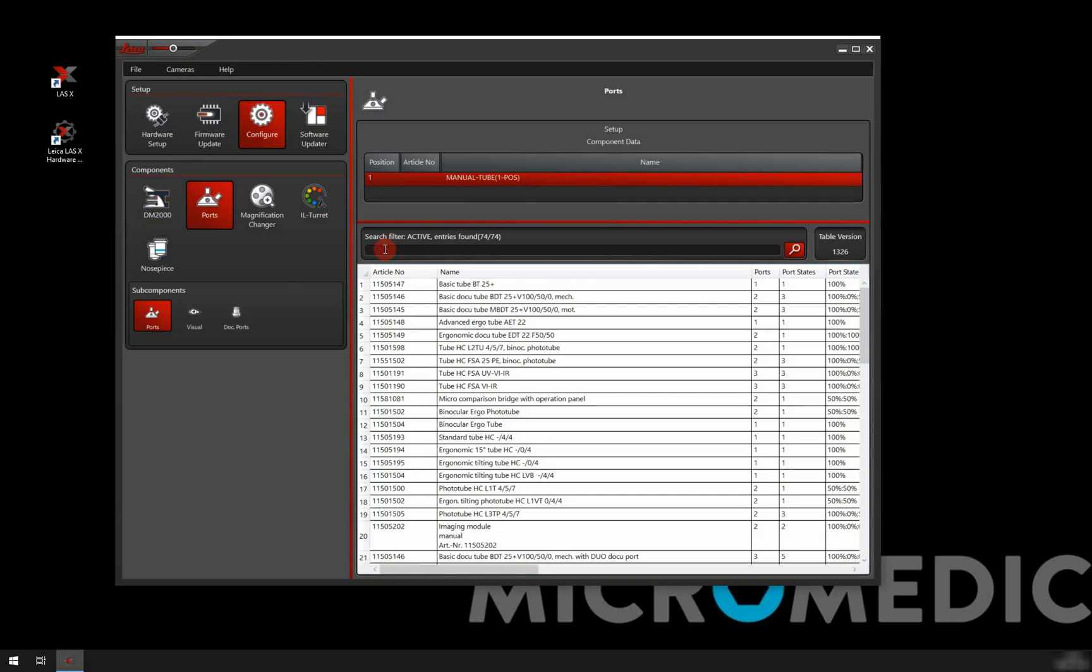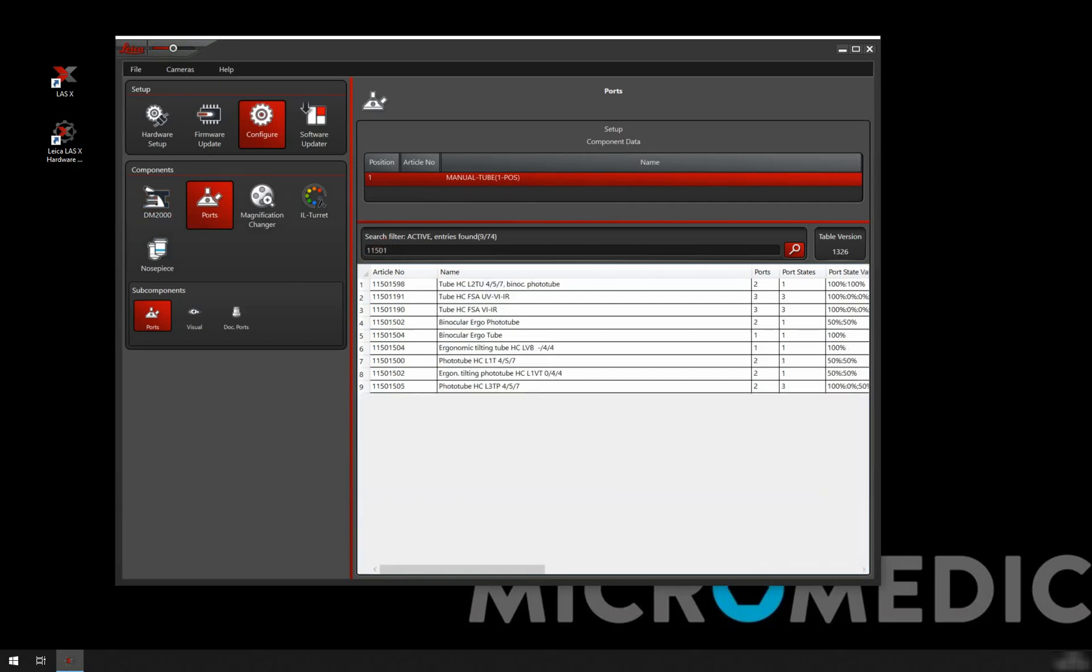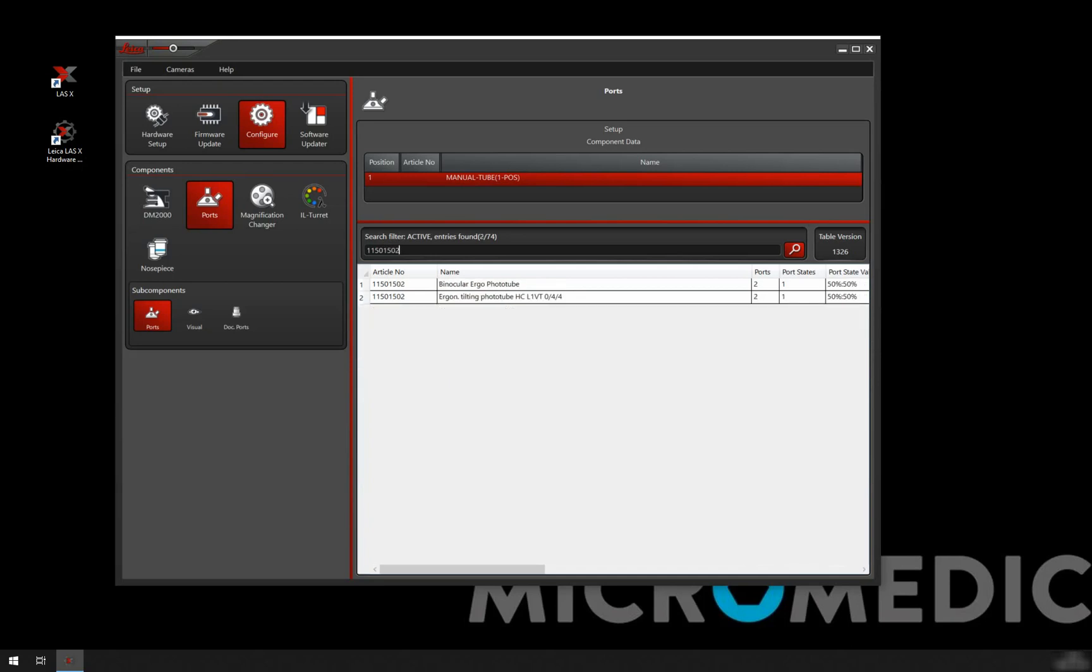For example, here I know that the tube that I have is the 11501502. You see that I'm typing it in the search filter.